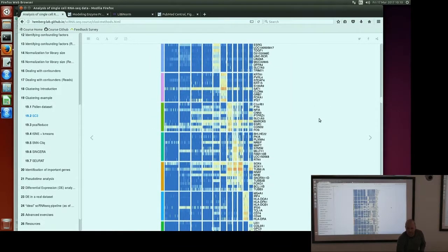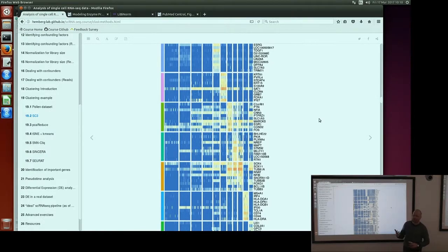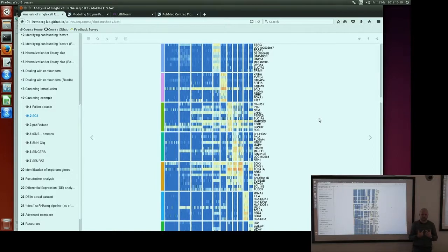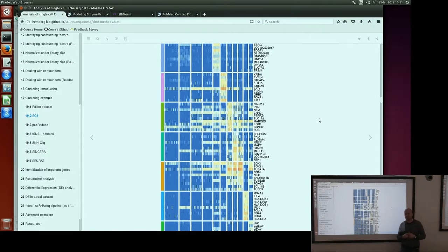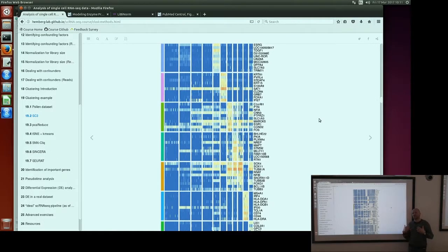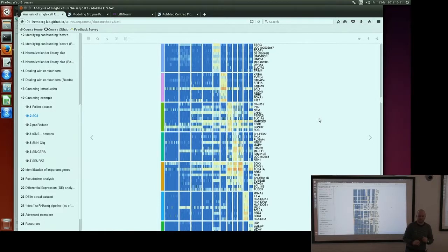Finding marker genes is probably the most popular feature of SC3 — it's probably the single task that people most want to do with their dataset. There is also a differentially expressed genes tab. Compared to marker genes, differentially expressed genes are defined as genes which have at least one difference between any of the clusters. If there is something different between any two clusters, those genes will be identified as differentially expressed. We don't do pairwise comparisons between each pair of clusters, but instead look across all clusters. You have p-values there, but we don't recommend using them as real p-values — just use them for ranking, because they're biased since the clustering is based on the same data.